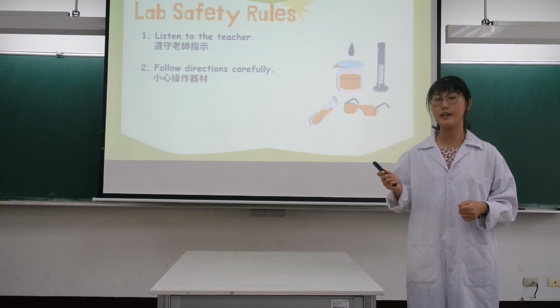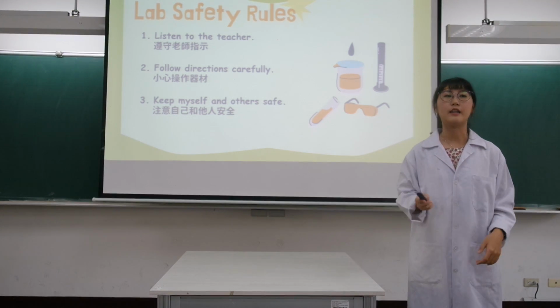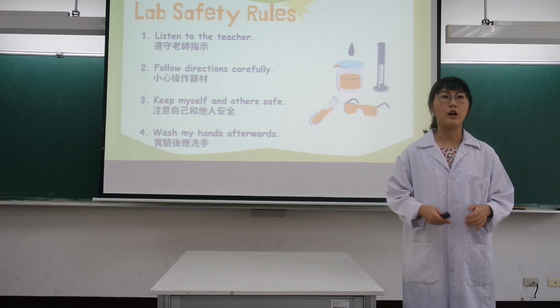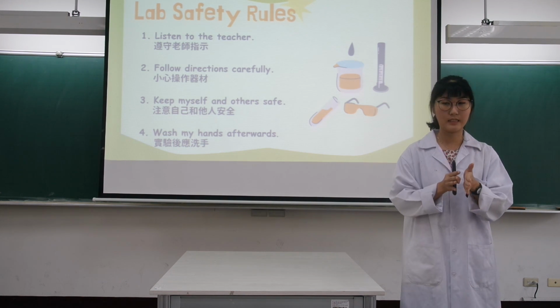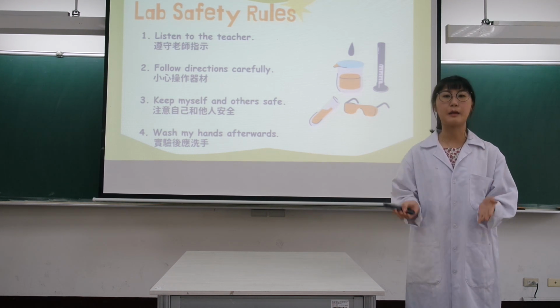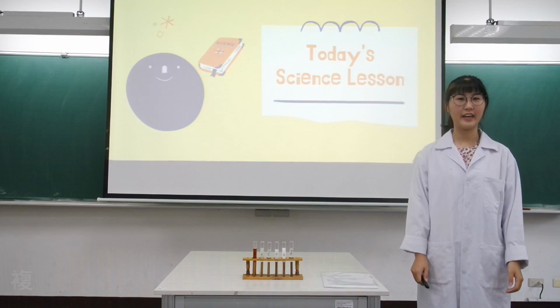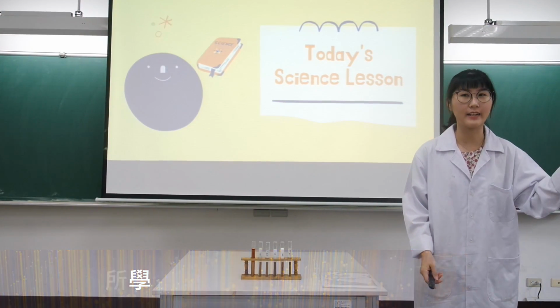Carefully. Number 3, keep myself and others safe. And number 4, wash my hands afterwards. All the solutions we're going to use are dangerous, so if you touch it, you need to wash your hands. 今天要用到的溶液啊，有些很危险，所以当你碰到的时候，请你立刻要去洗手哦。Understand? Yes, very good.